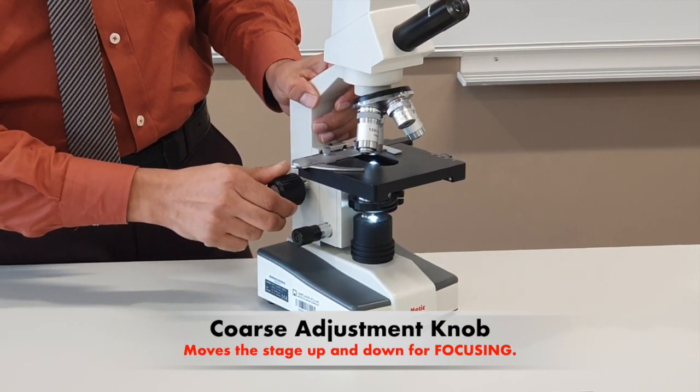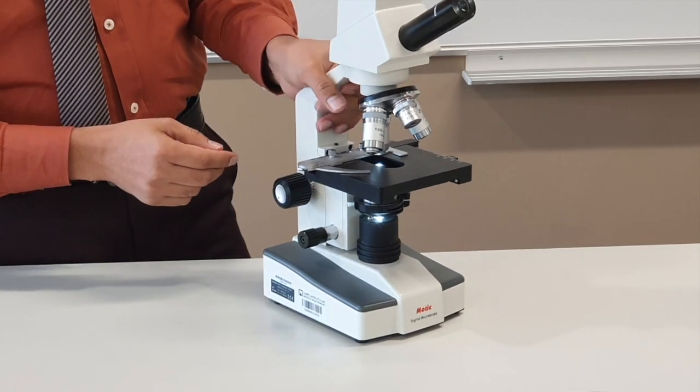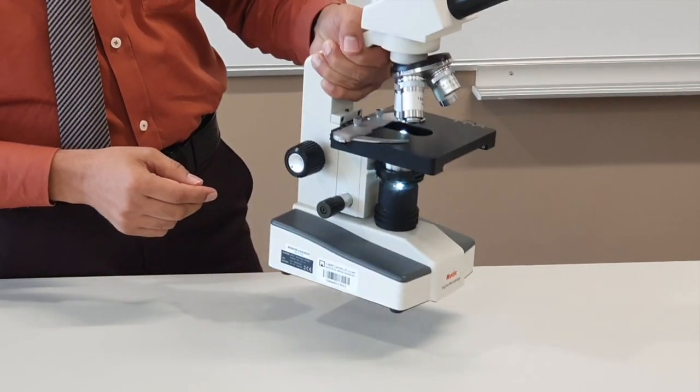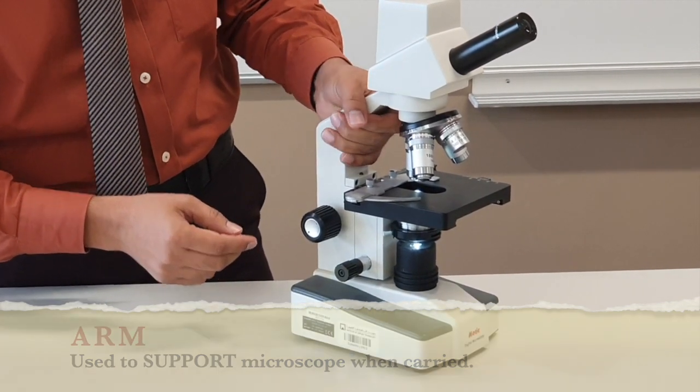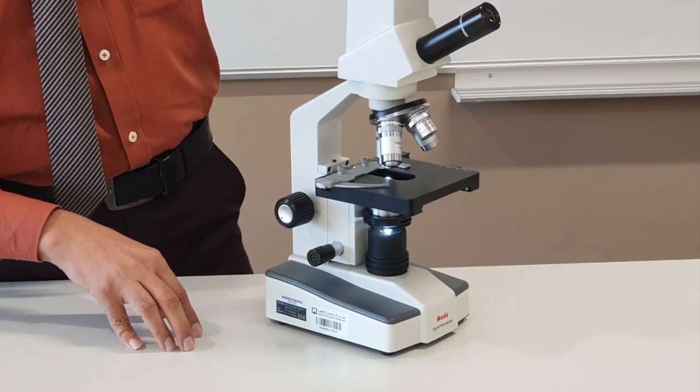Let's move up. This is the place from where I'm holding it. This is called the arm. The arm is the place from where you hold it to take it from one place to another. The arm is connected with three main parts.